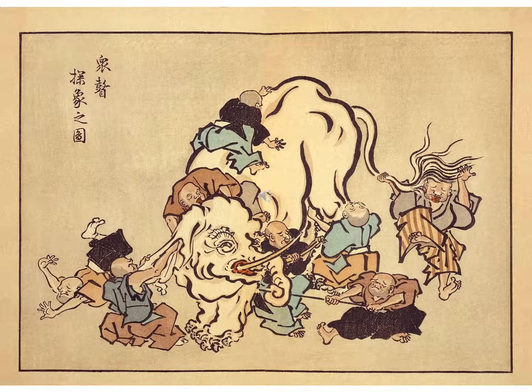Finally, in this lecture, I have a picture of an elephant being pulled by, I don't know whether you could recognize this, some blind men. This is an old folk tale which I think gives some interesting perspectives on the small angle scattering experiment. Each of the blind men have their own little area of the elephant to feel. None have the arm span to feel the entire elephant.